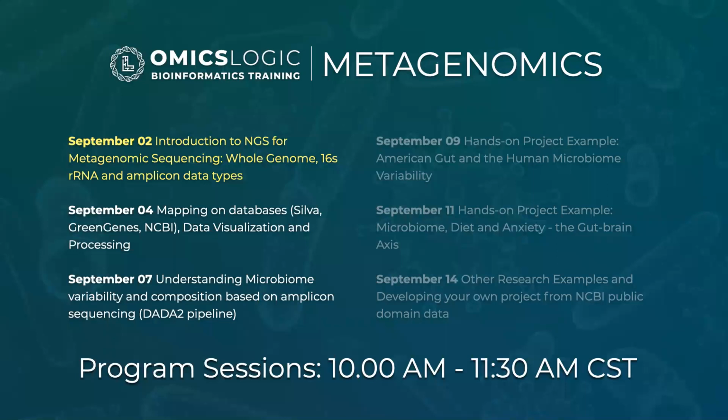Today, we will talk about metagenomic data. So how is this data generated? What are the different types of generating this data? What are some terms and formats that you have to be aware of so that whenever we make our progress into the next steps of the analysis of this data, we'll all be on the same page about what kinds of data are there and what we can do with that kind of data.